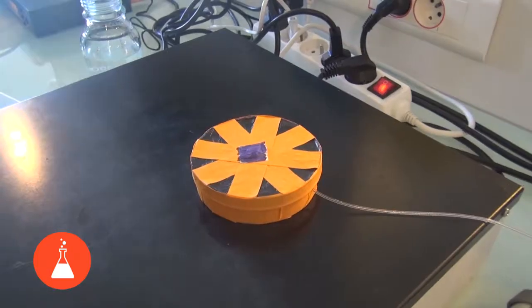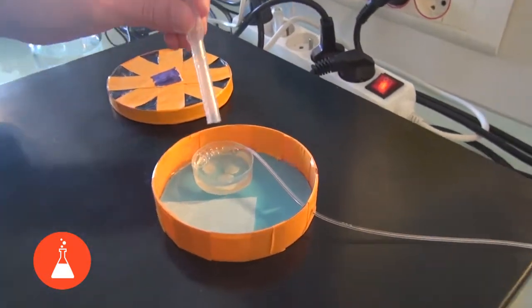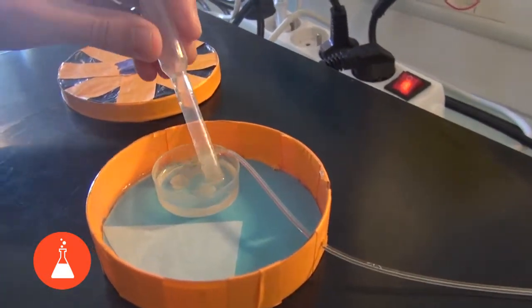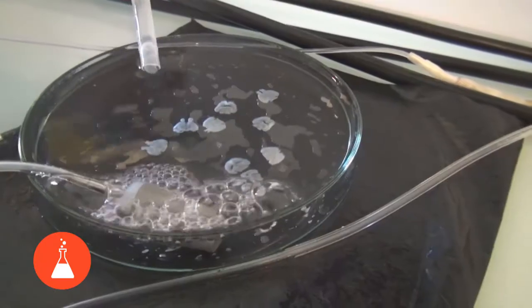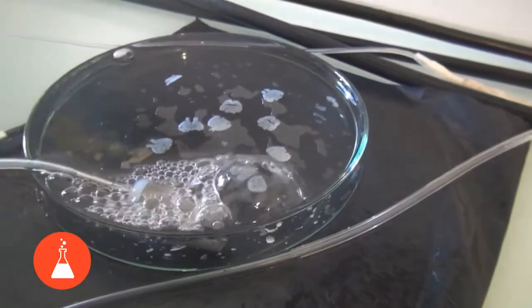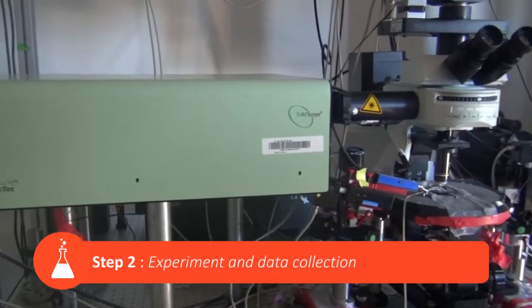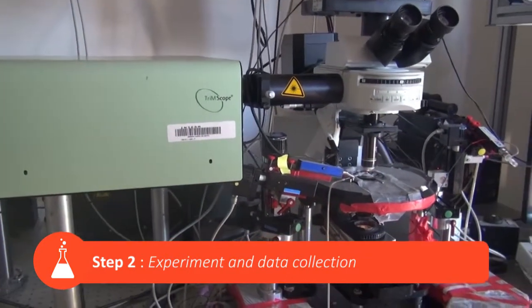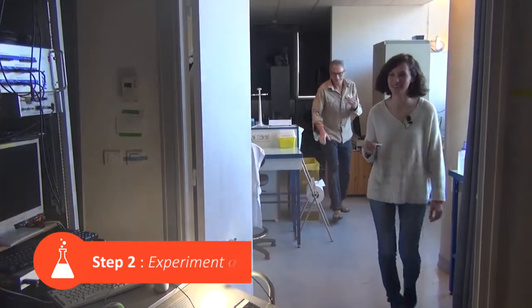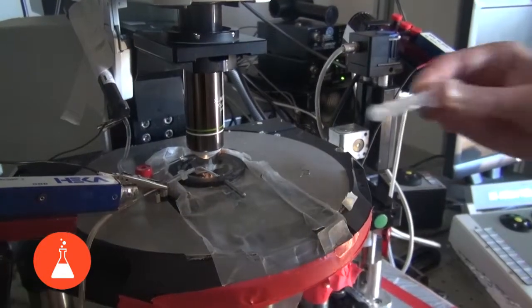Following 20 minutes of incubation, we rinse the brain sections in an artificial oxygenated extracellular fluid solution. In this recording chamber, there is an optical device capable of quick acquisition, i.e., producing an image of neuronal calcium activity every 100 milliseconds thanks to a special laser.